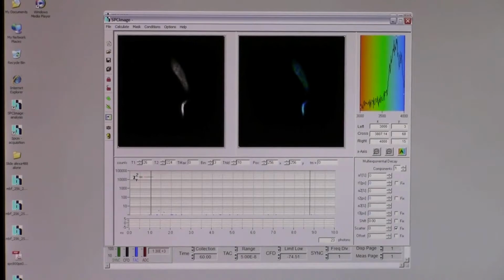So what we have here is a histogram that represents the lifetime of our cells. Since this fluorophore, our donor fluorophore, is M turquoise, we'd expect a natural lifetime of around 3.8 to 4 nanoseconds. And in fact, what we did get, when we look at the mode lifetime, is a lifetime of around 3.8 nanoseconds, which corresponds with the natural lifetime of the fluorophore.